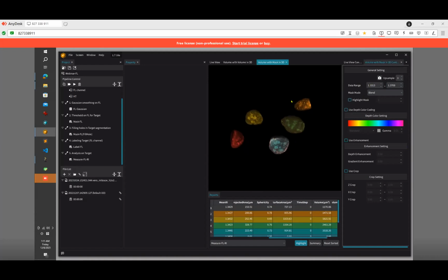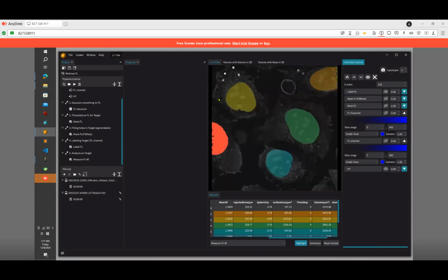So that's how this analysis and visualization works in combination. This is the basic workflow for the analysis. For the workflow explanation, I used this fluorescence pipeline because it's very simple to understand. And let's get to the LD.